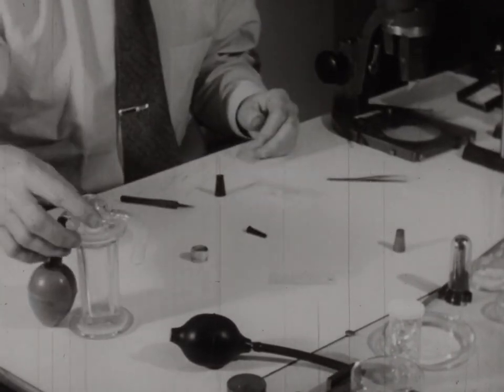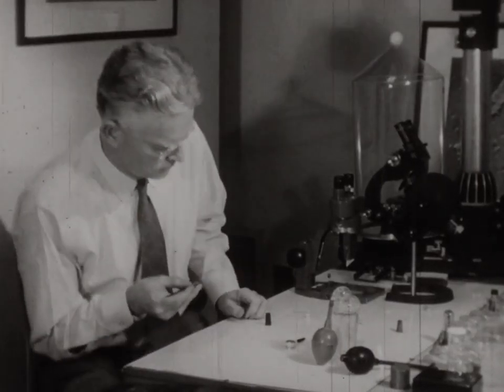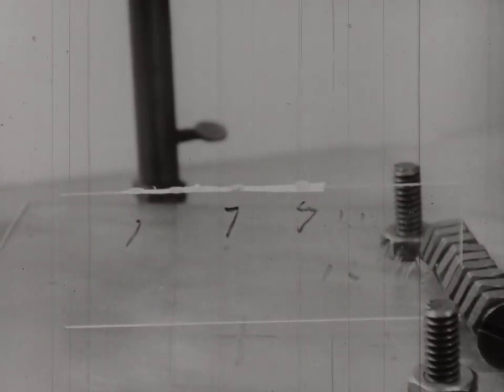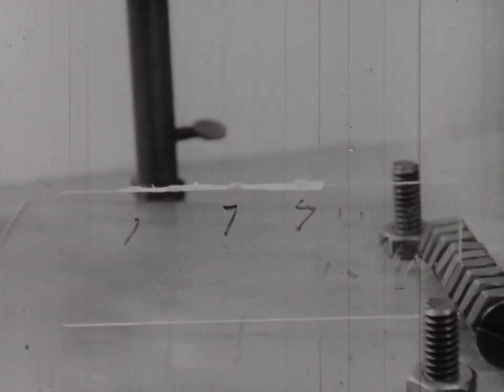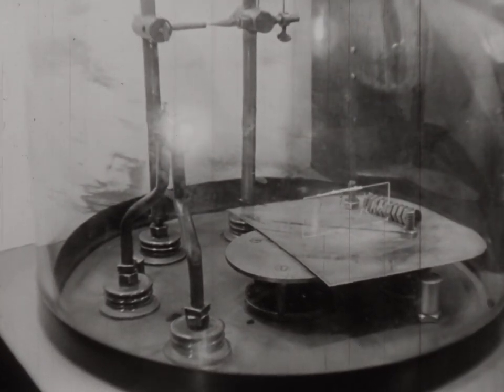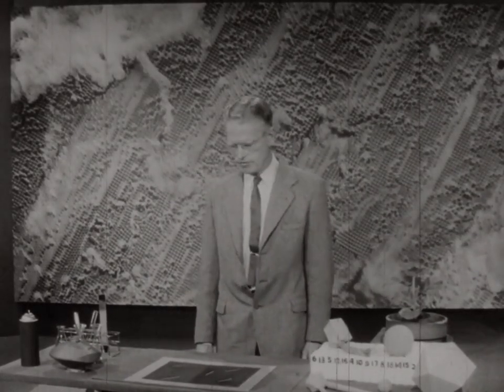Now we take the tiny grid with the virus droplets on it, which have now been dried, and we bring this over to a vacuum machine which has in it a filament of wire which can be heated quite hot, which causes a film of metal to condense on the far side of all the small particles like viruses that happen to be sticking up. We call this shadowing, and these shadows appear dark in the electron micrographs.